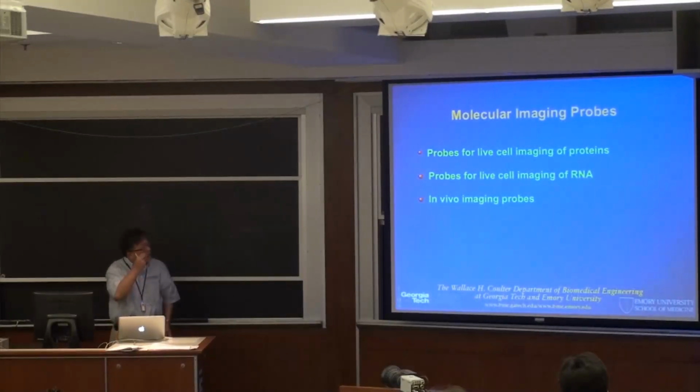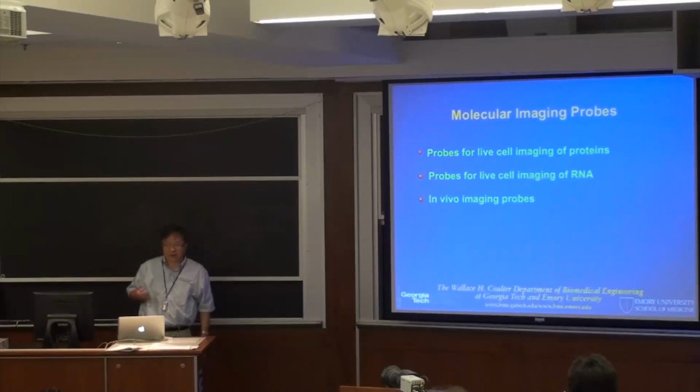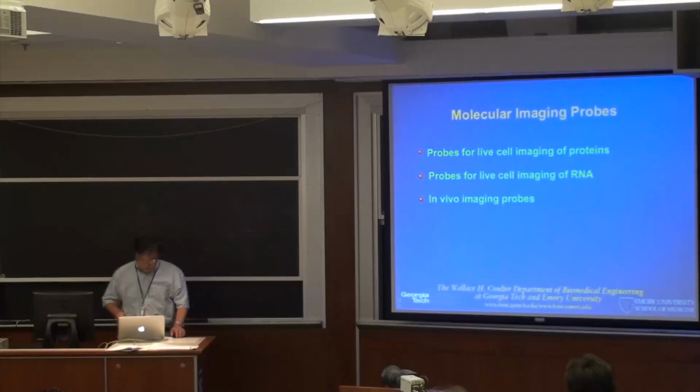In the rest of the lecture, I will first quickly mention some challenges in developing probes for imaging proteins in living cells. I will focus on probes for live cell imaging of RNA molecules. I will also give you some ideas of the in vivo imaging probes.